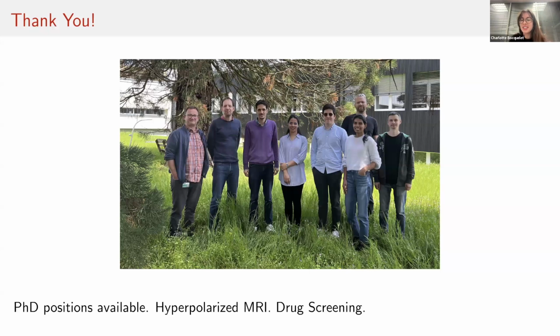I will start with my question. Benno, you said you figured out with the help of Anna that the optimal radical loading of TEMPOL was 25 millimolar instead of 50. So when you say the throughput is a dozen experiments per day, do you use 50 millimolar or 25? And if it was 50, how did you quantify how much the build-up time in the solid state is slowed down using 25 millimolar?